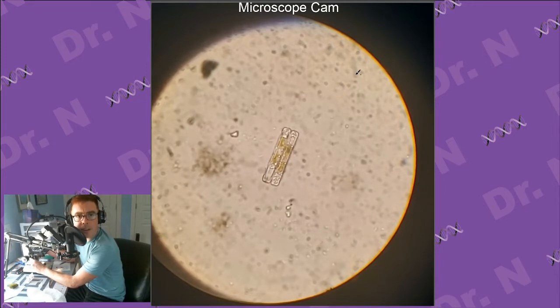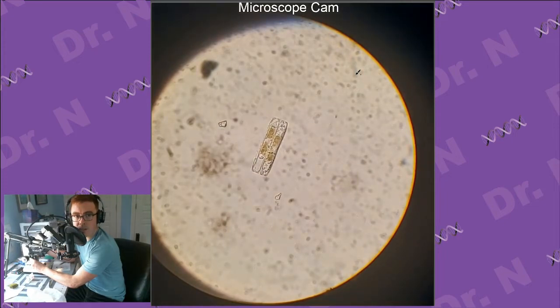Yeah, so what do we got here? So this is some kind of single-celled, I'm just going to guess, I always forget the term, plant, basically. Most of the time, if you're looking at something green in the type of sample that I'm looking at, you're probably looking at something that can do photosynthesis. But whether or not this is maybe actually some sort of bacteria, I don't know.